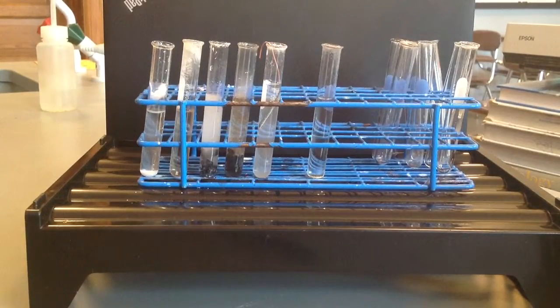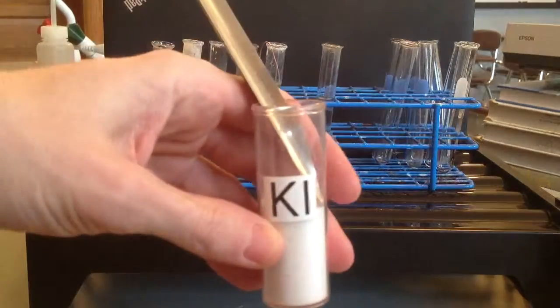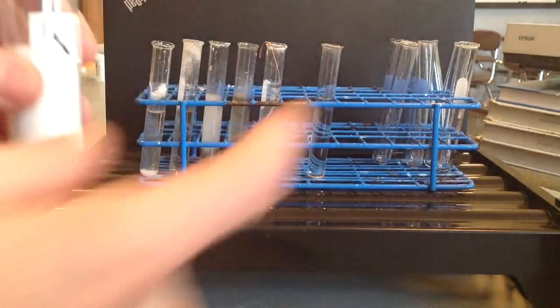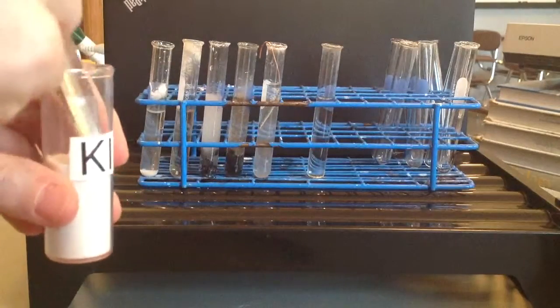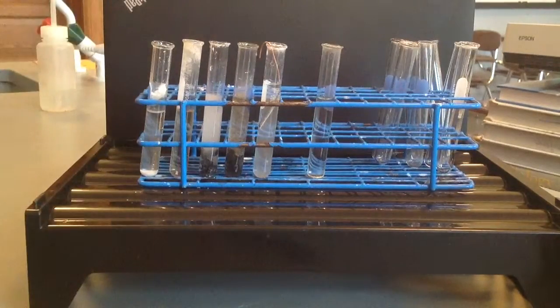Okay, now it's time for step five. First one is chlorine water, or aqueous chlorine, that we're going to mix with. We're making a slight change here. Instead of sodium iodide, we're going to be adding potassium iodide. So we're going to add that to the test tube that has chlorine water in it, and we're going to see what happens. I'm going to add some, and then I'm going to stir it.